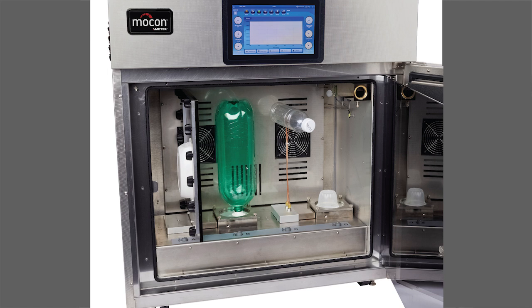So for this type of sample, there's an ASTM F1307 that talks about drilling 2 holes in my package, putting my copper tubing inside of it, epoxying those in place, and then I'm sweeping this nitrogen gas inside of here.